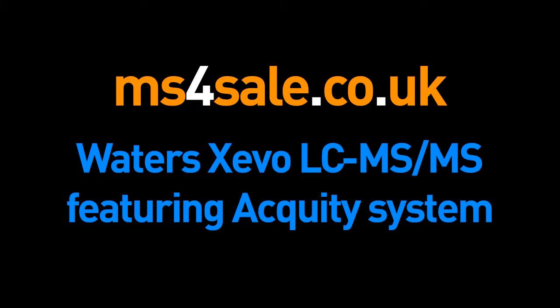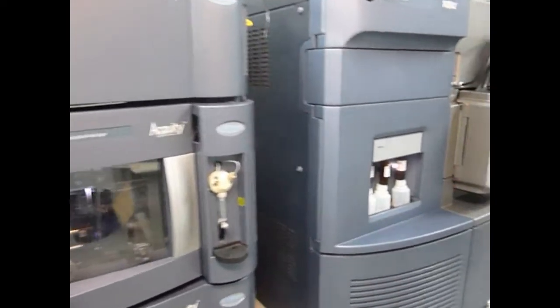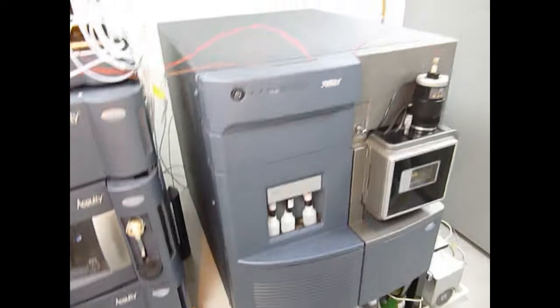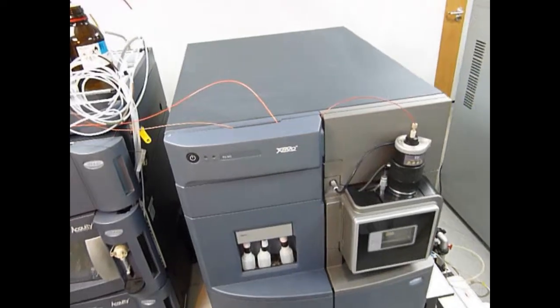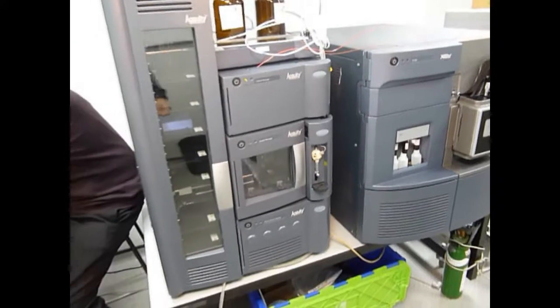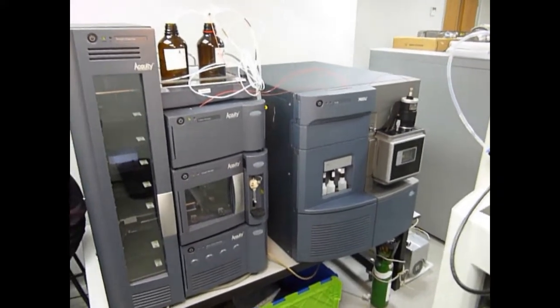We have here for sale the Acuity Xevo LC-MS-MS system, which consists of the triple-quadrupole mass spectrometer, the TQ-MS. It also has a sample organizer, which as set up now will take around 336 samples, a column manager where you can actually heat your samples, and then you've got your Binary Solvent Manager.